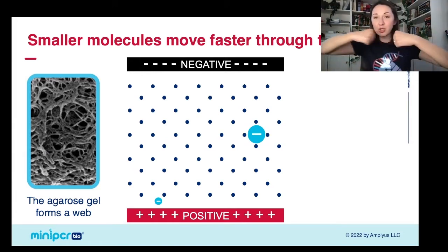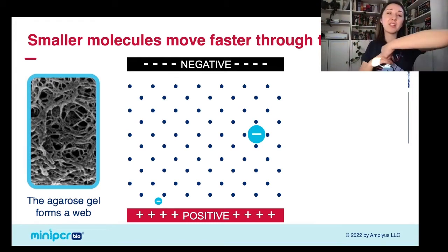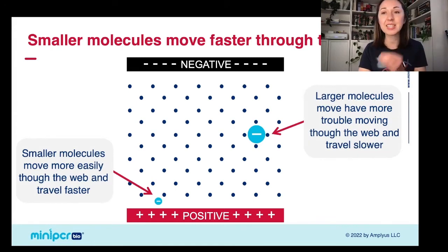So you sort of have these two forces pulling in either direction on these molecules, one that's pulling them through the gel and one that is resisting that movement through the gel. And so you're going to be able to separate these molecules not just by their charge, but also by their size. So again, smaller molecules move through really easily. Larger molecules will get stuck and have trouble moving through that web of gel.